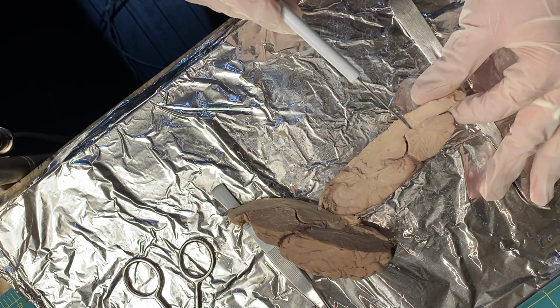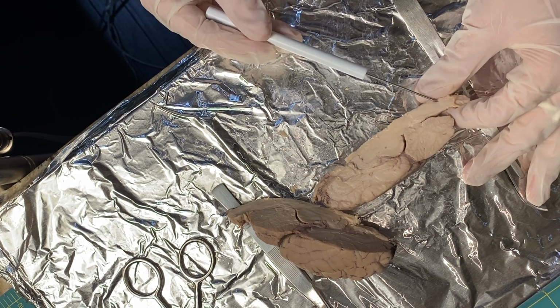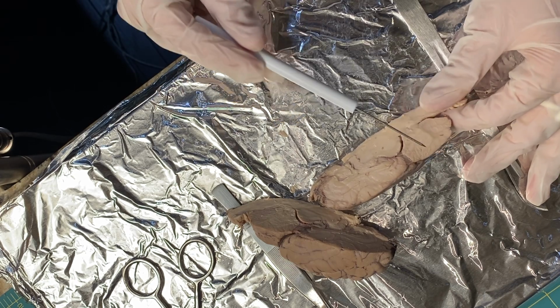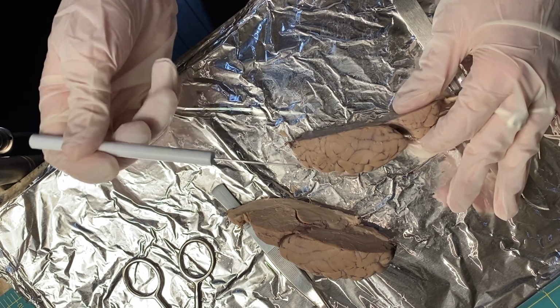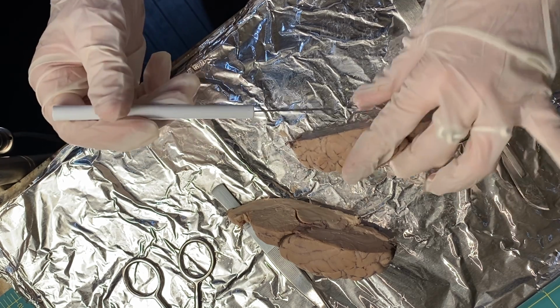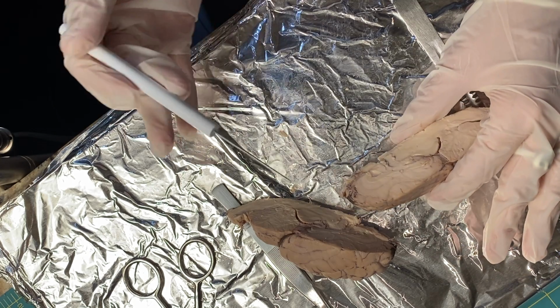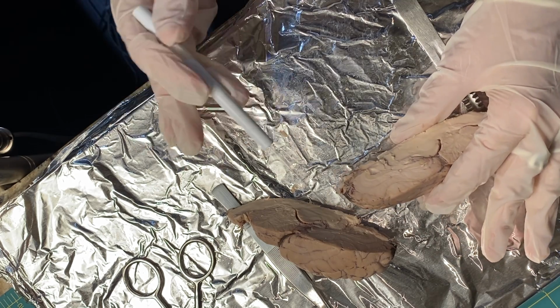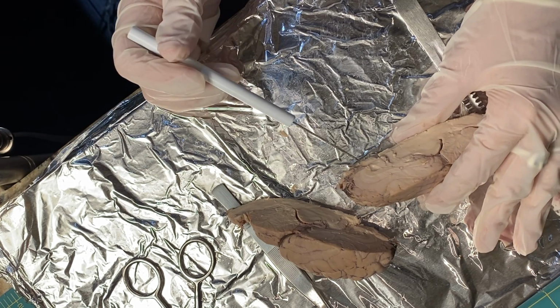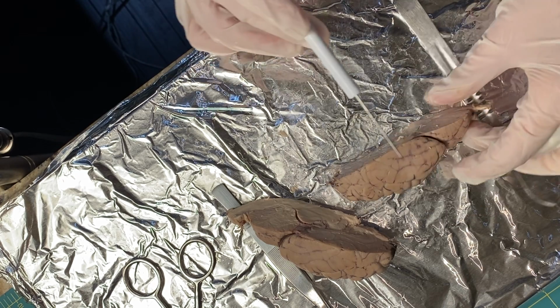Brainstem. And then we've got the spinal cord. So the spinal cord is connected to the brainstem, which connects to the brain. So we've got white and gray matter. So white matter are bundles of axons within the brain and the spinal cord. They're typically found in the inner portions of the cerebrum and the outer regions of the spinal cord.